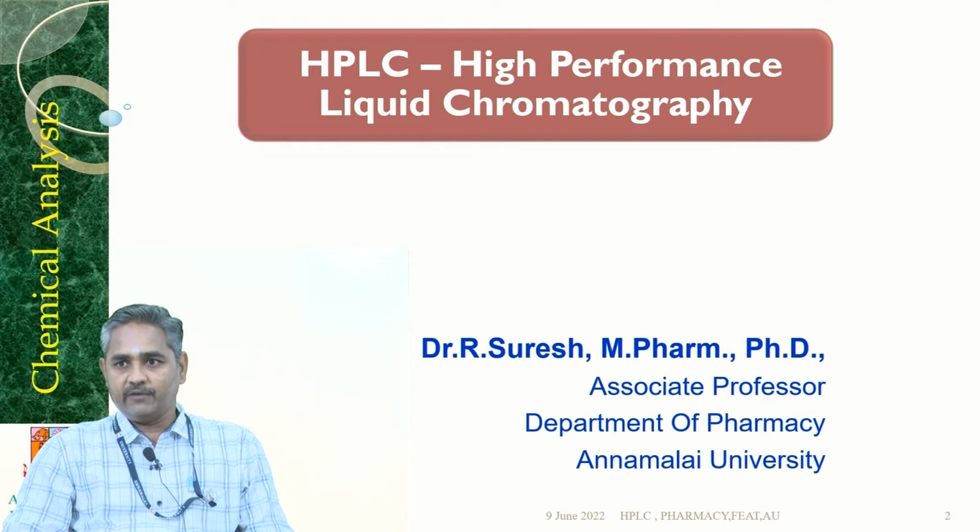In common man language, it is otherwise known as high patience liquid chromatography. Why are we calling this high patience liquid chromatography? It needs a lot of time and a lot of energy to do this experiment in the HPLC instrument, because when you want to separate a chemical compound, you cannot directly go to the lab and separate it.